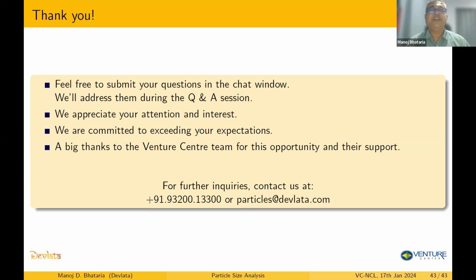Okay, let me answer. See, when I'm saying it is not good for broad particle size distribution, we are always comparing with some other analysis. So this is in comparison to, let's say, a sedimentation technique. Sedimentation technique is good for very wide particle size distribution. But if you were to do the same analysis, let's say the same sample in DLS, your results would be completely different. And you feel that the size distribution that I got in the sedimentation, why am I not getting the same size distribution in DLS? Because of the biases of the DLS, you may not get the broad size distribution that you're getting in sedimentation.